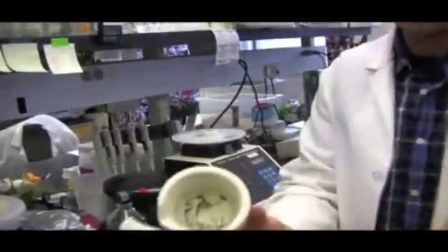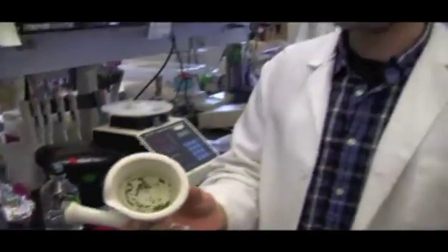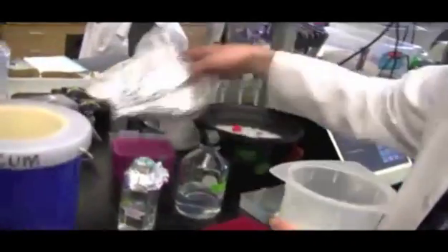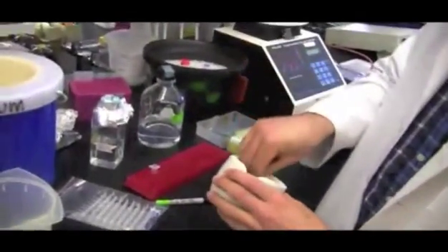What you end up getting is this powder. And so within that powder is everything within the cell. So like we said before, there's carbohydrates, lipids, proteins, nucleic acids, and we want to just get the nucleic acids out. So we're going to have to extract that somehow. So how we do that is take one of our handy dandy tubes. This is where a lot of biology happens, within these tiny little plastic tubes, and we're going to get some of this plant powder in here.